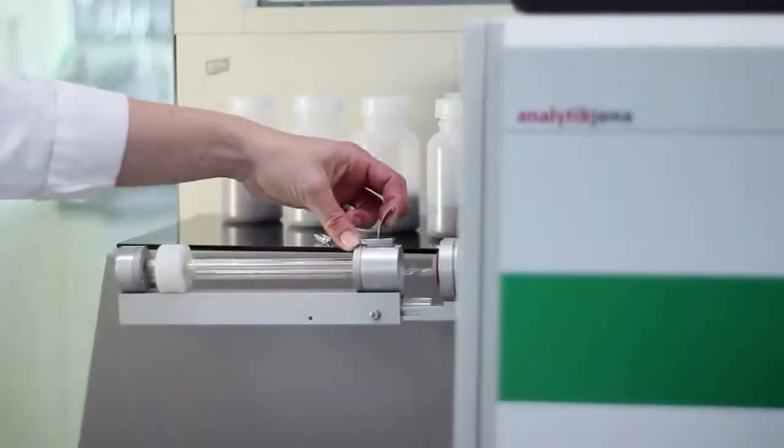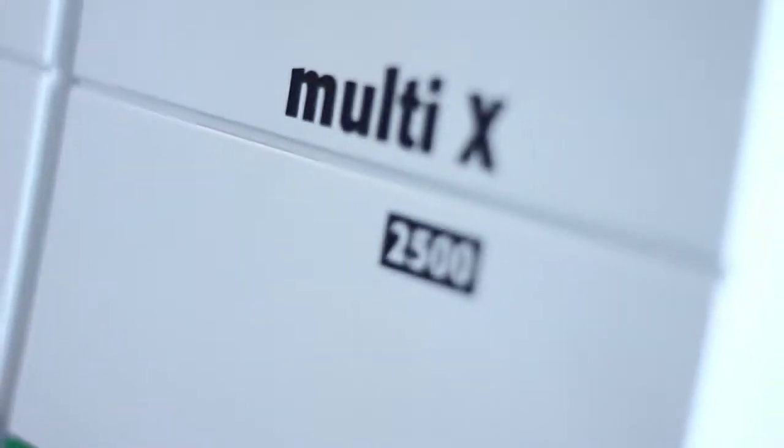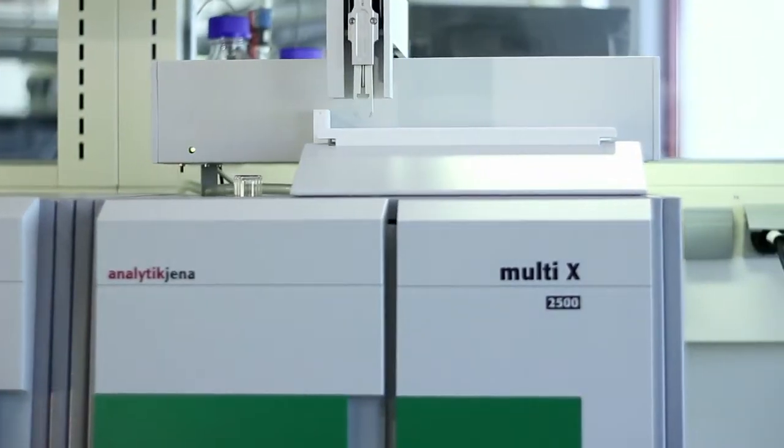Flexible and fast TOX, EOX or POX analysis are possible with our system multi X 2500 and its innovative double furnace technology.